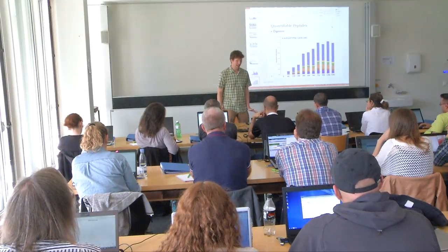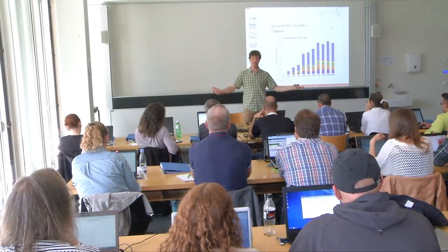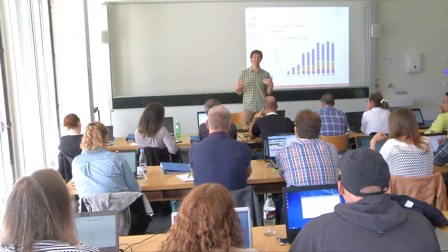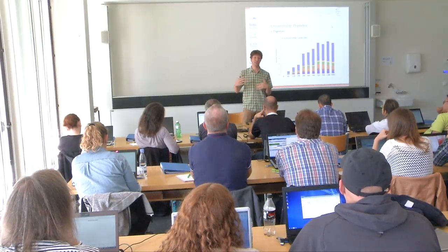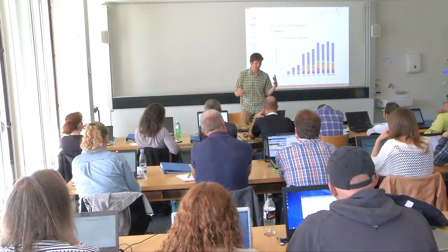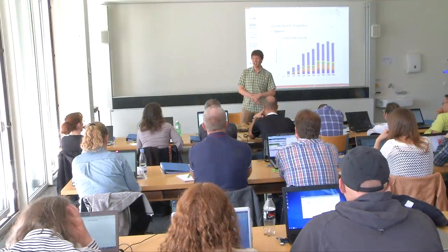Well, yeah, we definitely would like to add more features, but I'm also going to show you how to deal with it with 42 samples. SkyJam was developed in response to people who were talking about how you have to look at every chromatogram, every transition, and you don't.